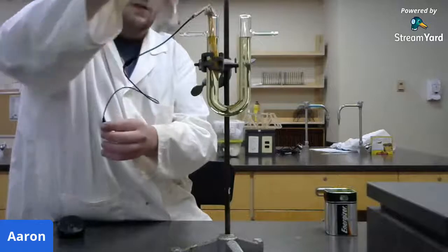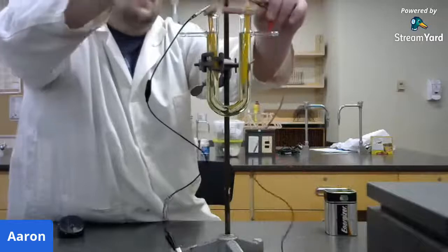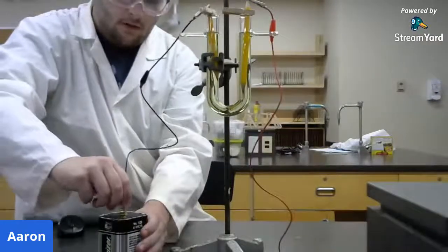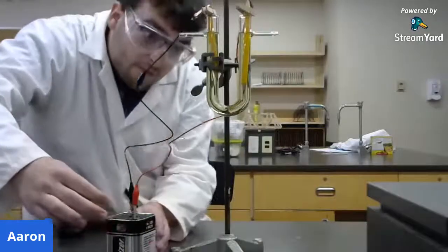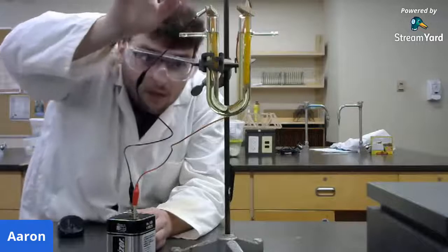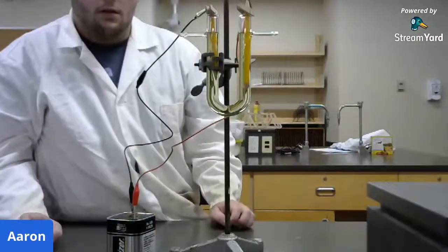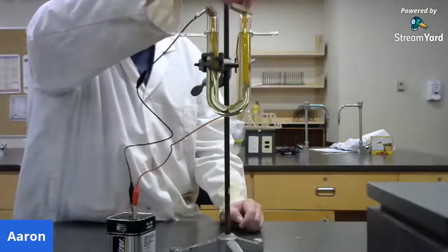Then we're going to put the pencils into our U-tube so that they are submerged in water. And I also have a battery here. So I'm just going to hook each side up to the battery. It's a little hard to see at first.